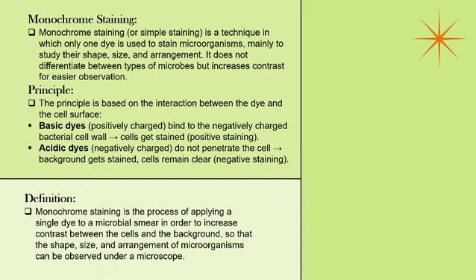It means monochrome staining is a staining technique which uses only one dye and is mainly used to study their shape, size, and arrangement, but it does not differentiate types of microbes, but it increases contrast between microbes and background.